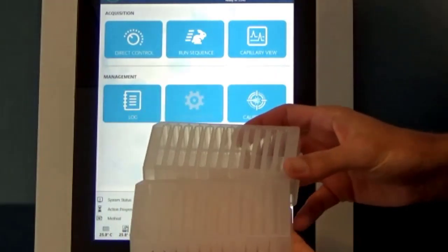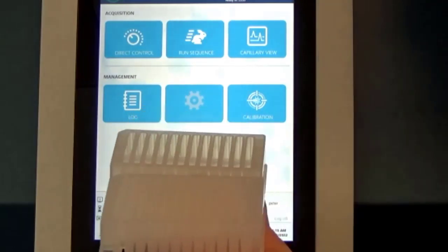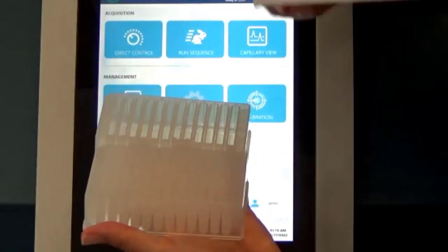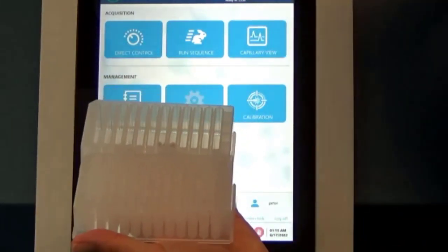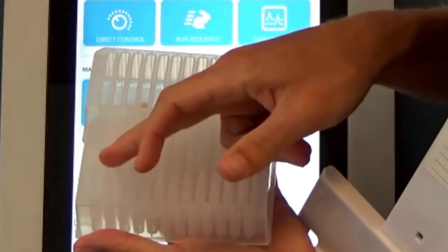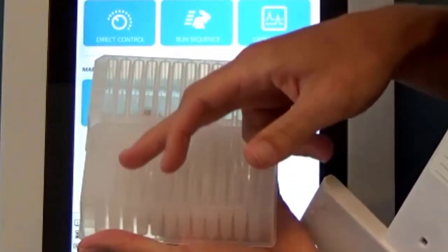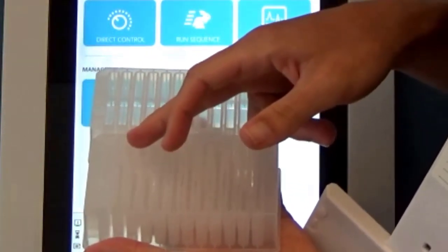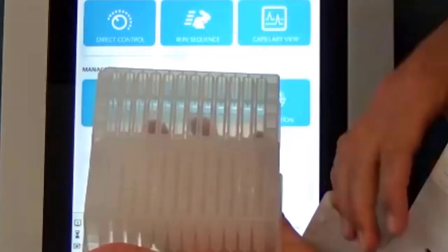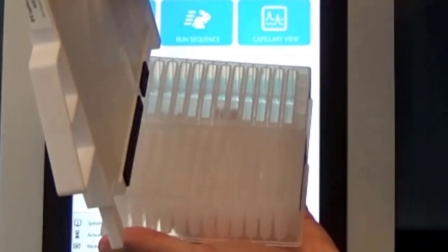So the BioPhase 8800 is a 96-well plate-based format system, but it has some unique plates here. On the bottom of my hand, you can see our reagent plate. A reagent plate has 8 individual reagent wells for 8 individual capillaries. So each one is going to have an independent well that it's sourcing from so that we maintain independent injections. Now our outlet tray has 1 trough because all 8 capillaries on the outlet side are going into the same well there.